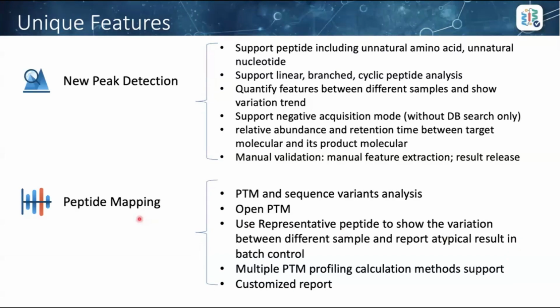And for peptide mapping, I think people are very familiar with this function. In this function, ProteoformX provides not only the normal unexpected modifications or sequence variants, but we also integrate open PTM search.